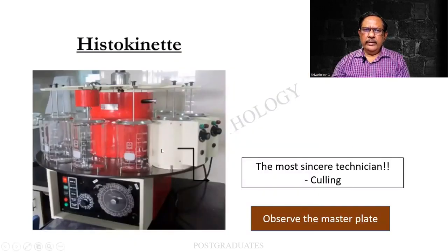The instrument that we are seeing on the screen is the Histokinette, and Culling, the great author of histotechnology, has defined this as the most sincere technician. Why, we shall see.